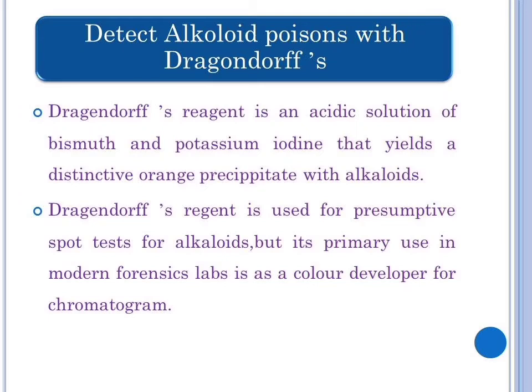The alkaloid poisons with Dragendorff reagents. The use of spectroscopy and other instrumental analysis techniques became common in forensic technology.